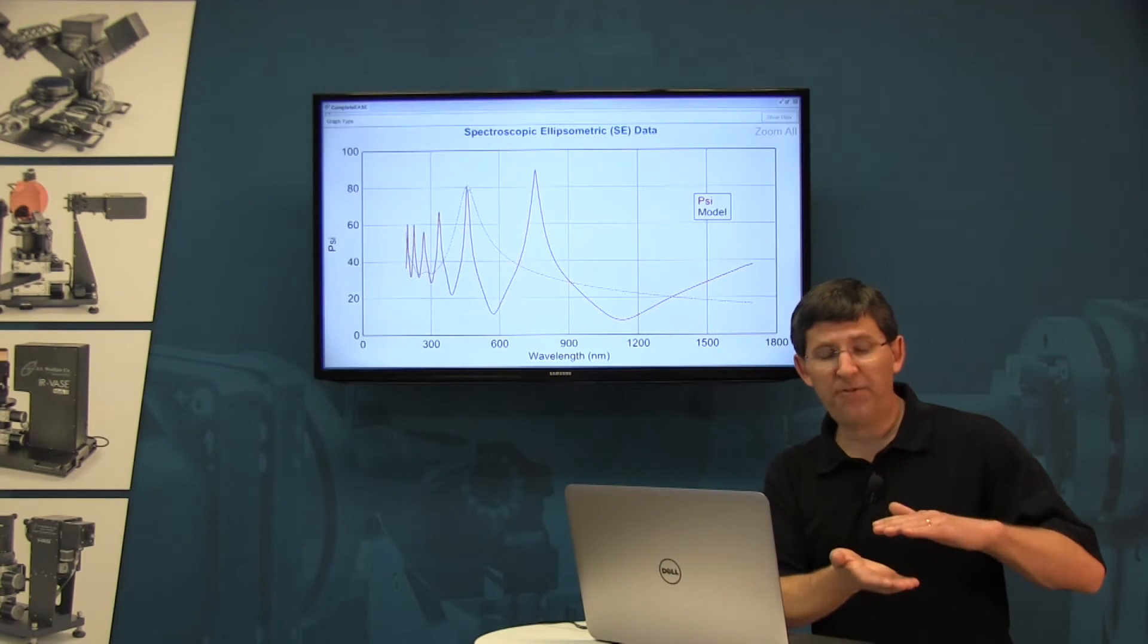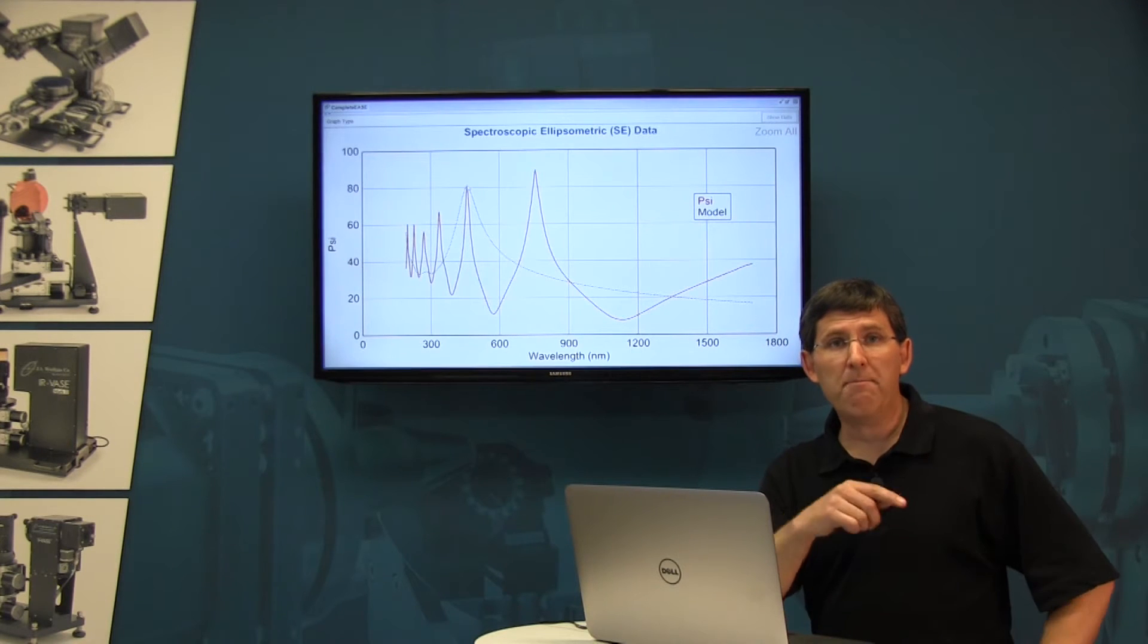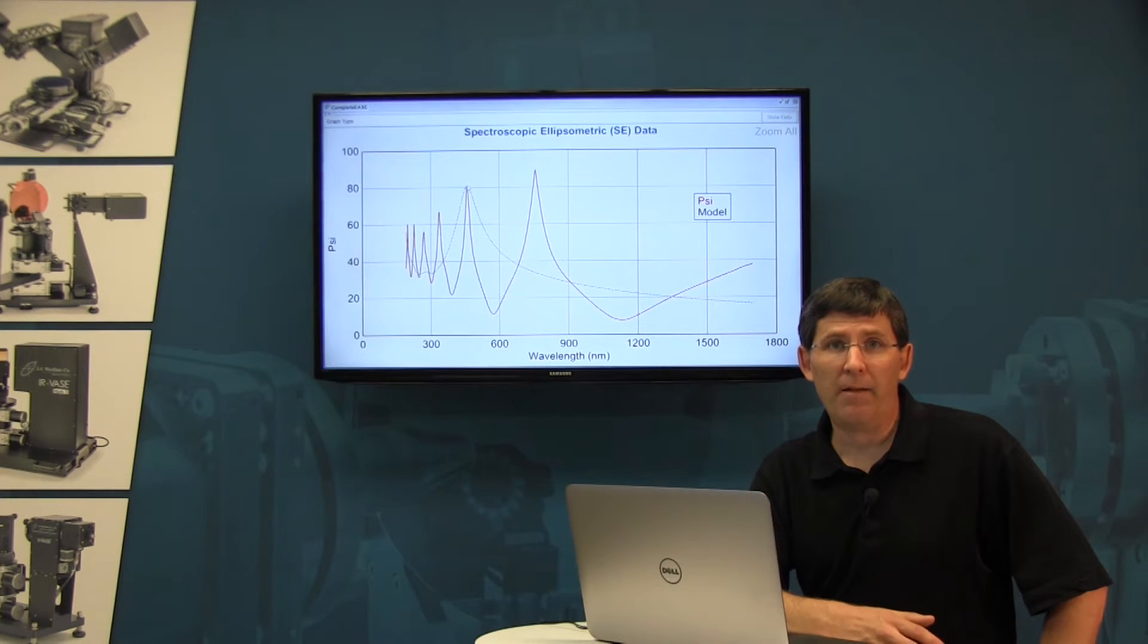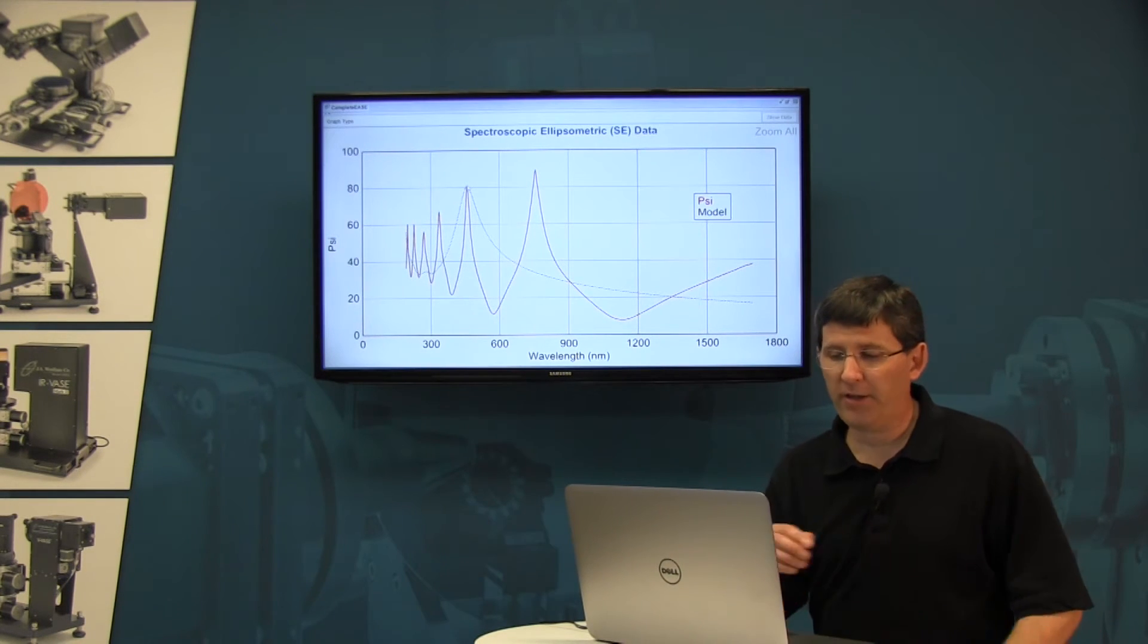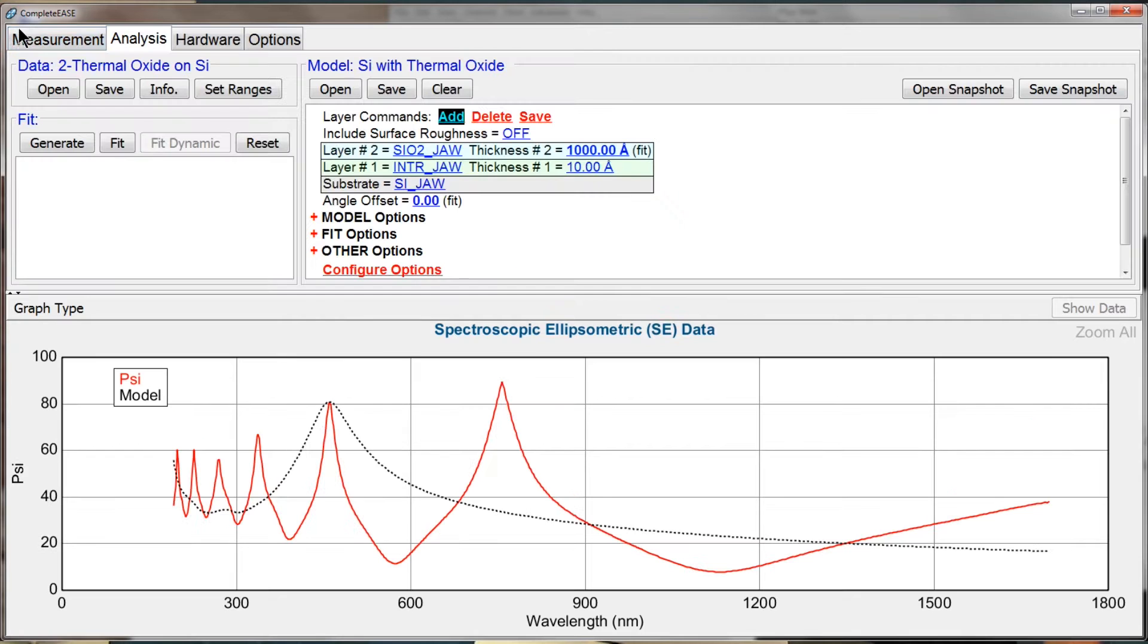Now in general, as the film gets thicker you're going to get more peaks and valleys in your data, and that's one way to tell how thick the film is. Let me jump back to the model here and let's change the thickness.